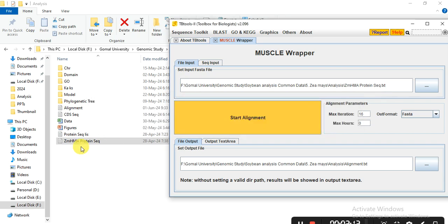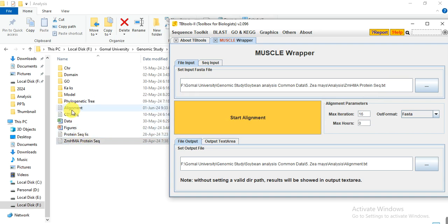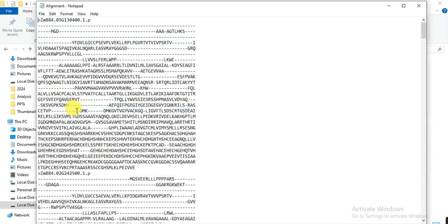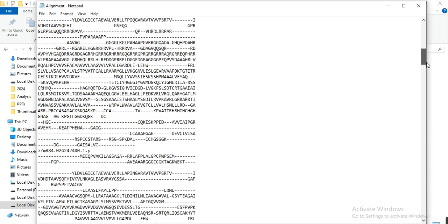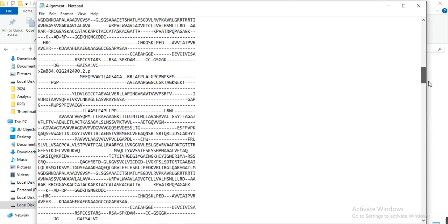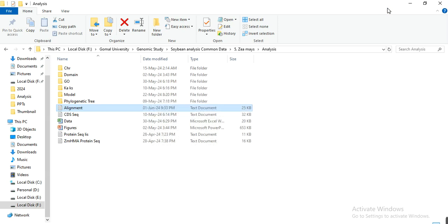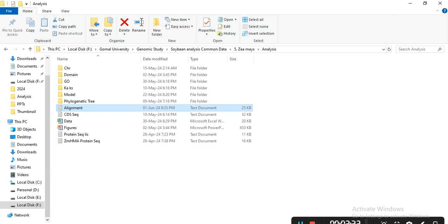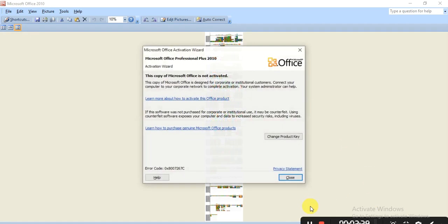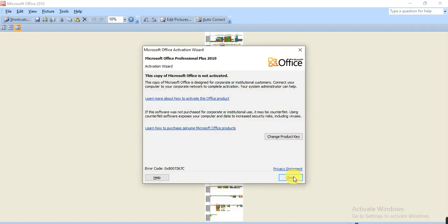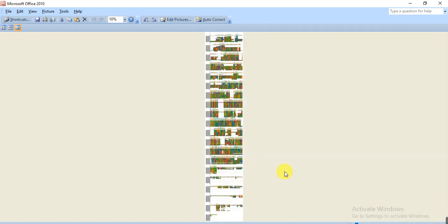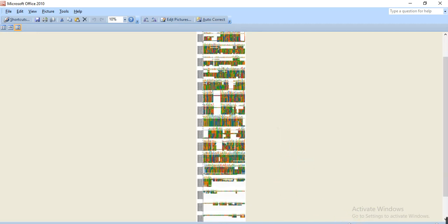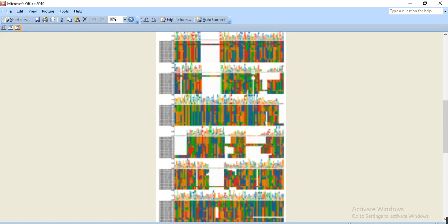Okay, so here is our file, this alignment which appears in the FASTA format. And now we have to check that picture where this alignment appears. Here I saved it, so open this picture. So this alignment appears in this picture format.